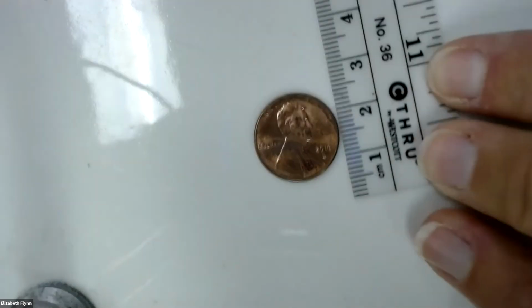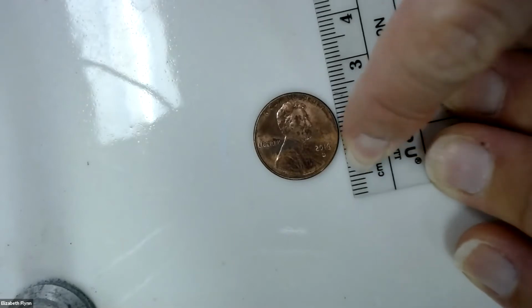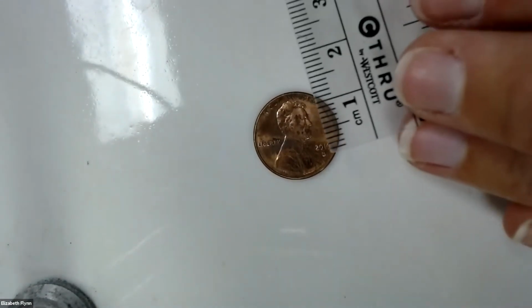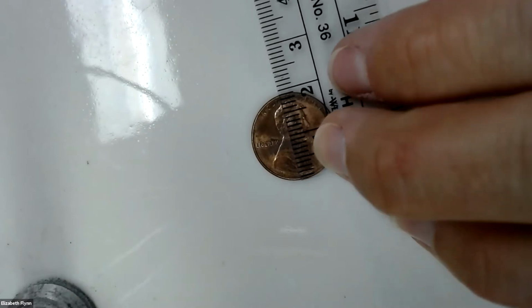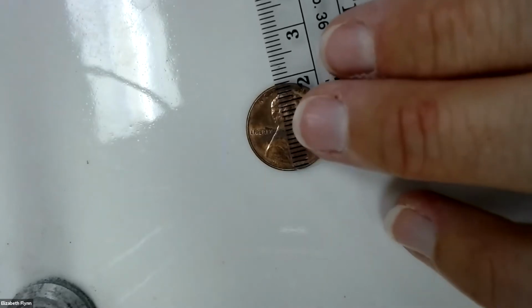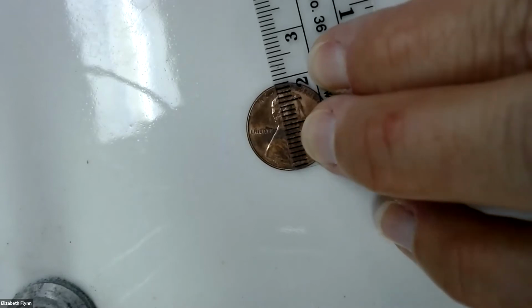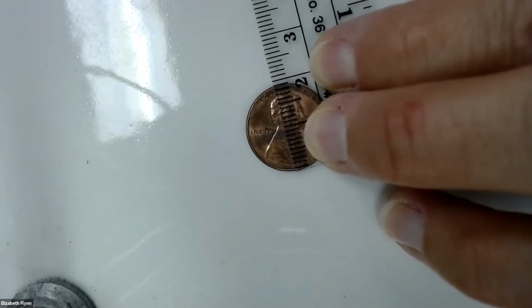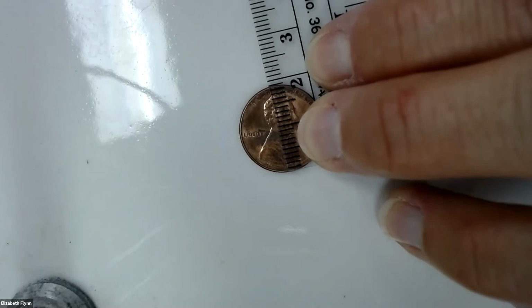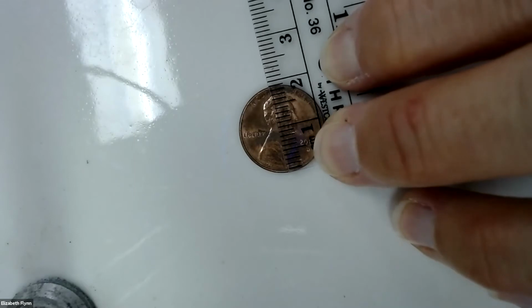See what I mean? I've got 0.1, 0.2, 0.3, 0.4, 0.5, starting from the edge. So just make sure you're paying attention to your ruler. All right, so we're going to measure the diameter. I'm going to line up the very edge of my ruler because that's my 0. Getting the diameter. And what do we say? What is that measurement here? What do we think?